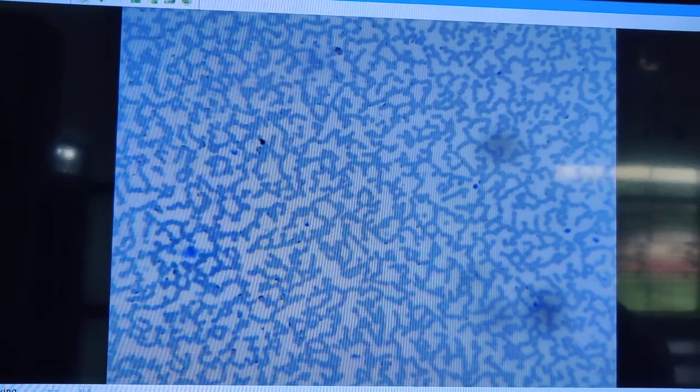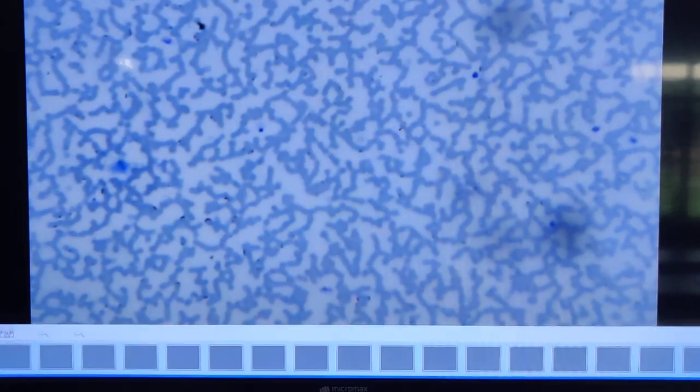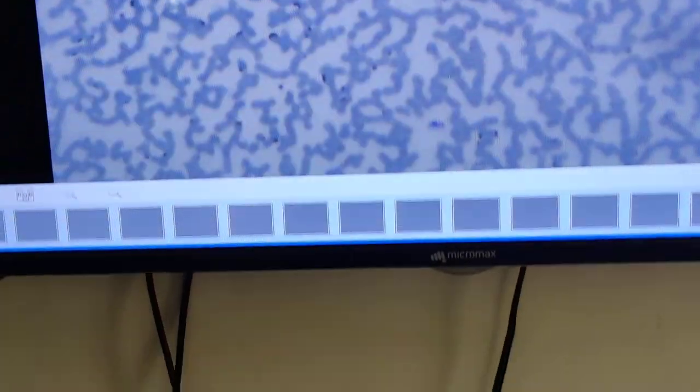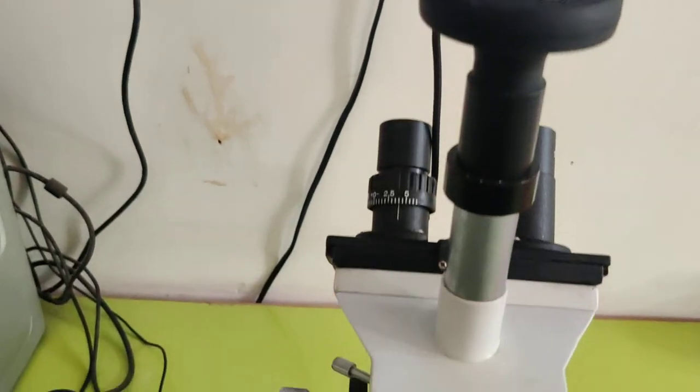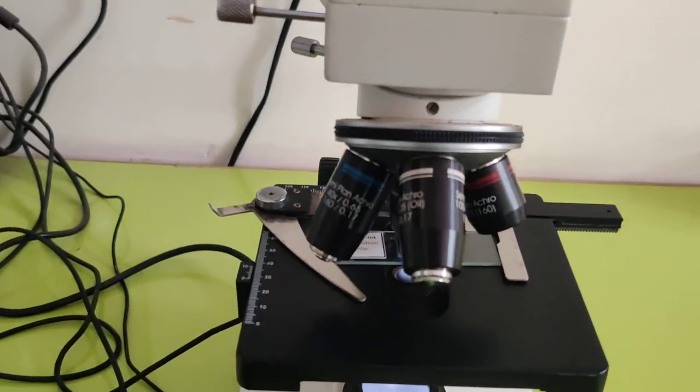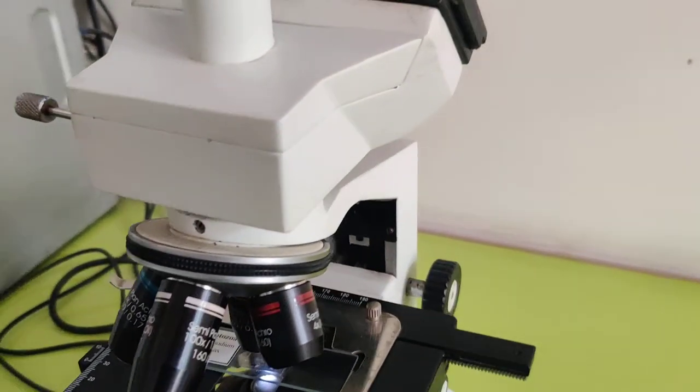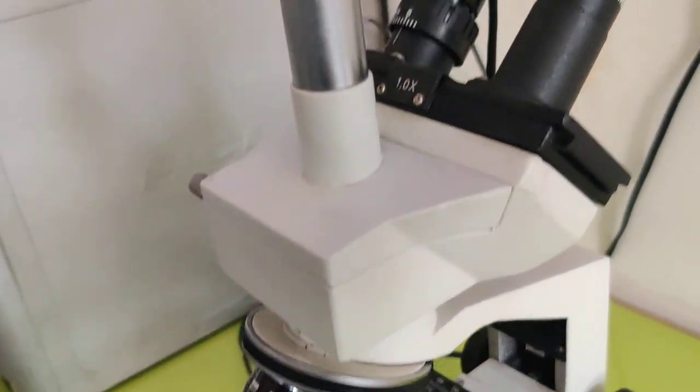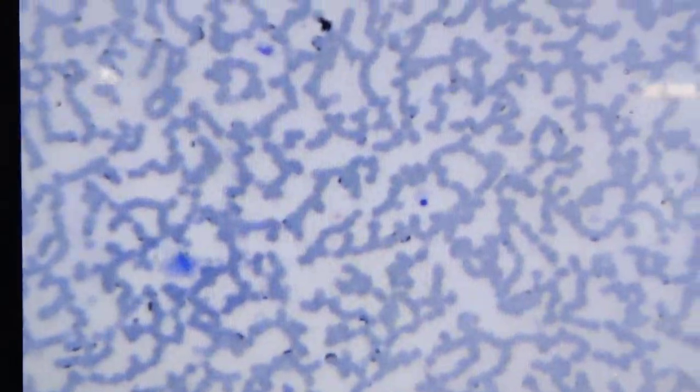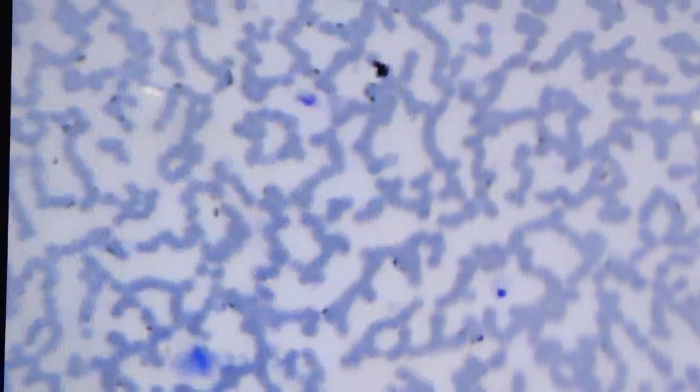To see the structure of different types of WBC, you have to take the high power of microscope. This is the microscope by which I am showing you this slide.